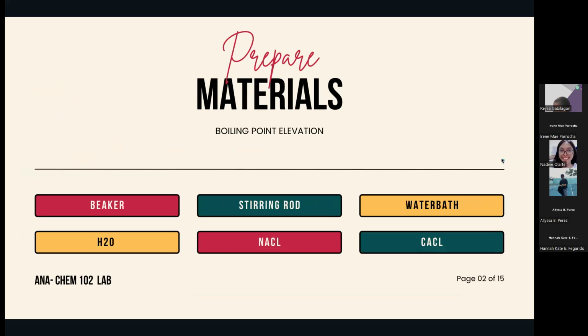During the experiment, we used these materials: beaker, stirring rod, water bath, water, sodium chloride, and calcium chloride. So I'd like to pass the virtual floor to Ms. Guanzon for the continuation of the report.